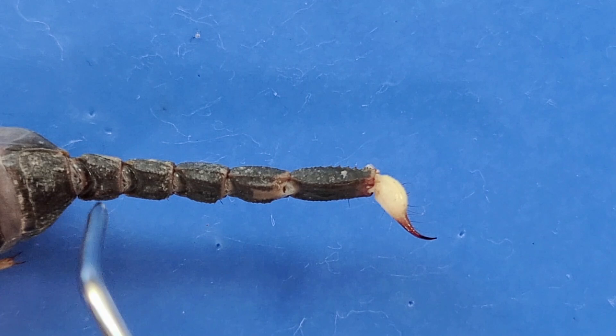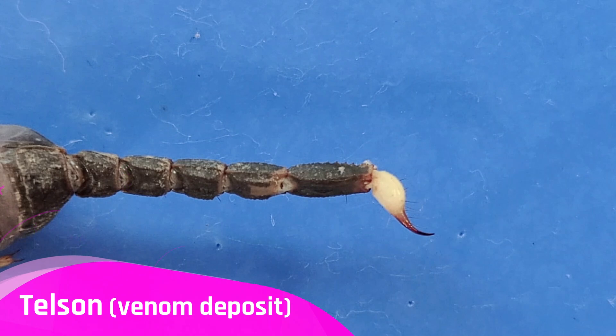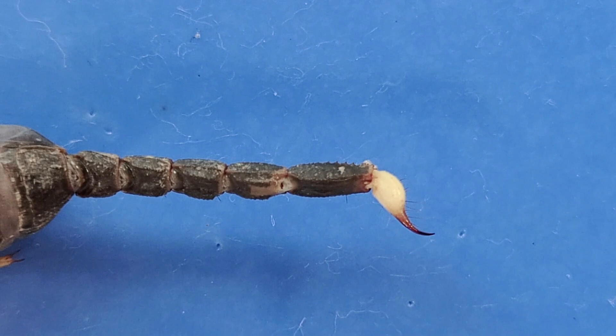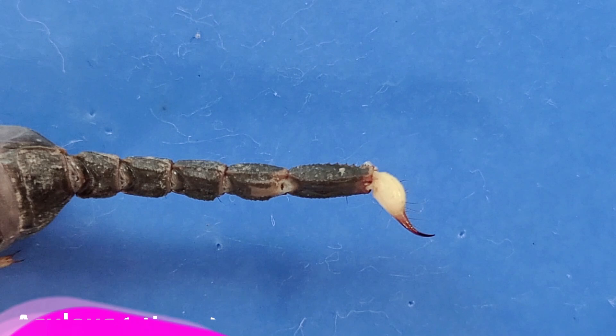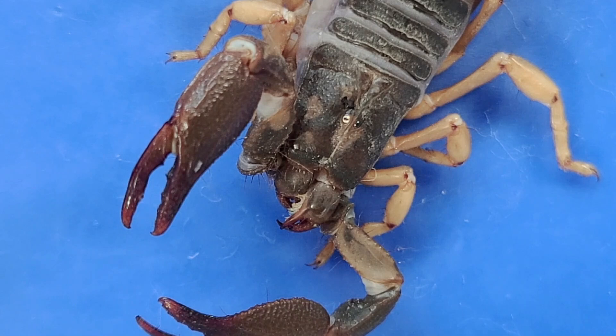The metasoma has five segments. There's a venom deposit near the end — this white bulb here — which is called the telson. The telson is a vesicle-like organ that stores the poisonous glands. And of course, the stinger, right here, also called the aculus. The venom travels from the telson to the stinger, and is injected into the victim's body.